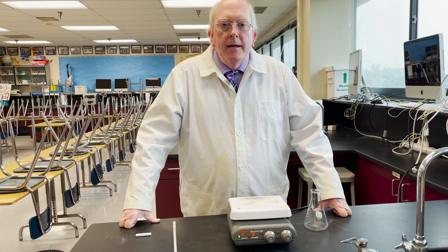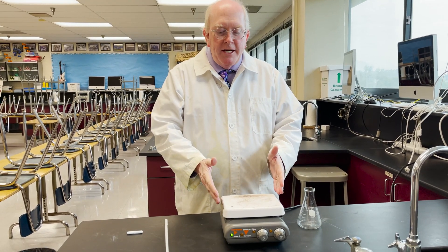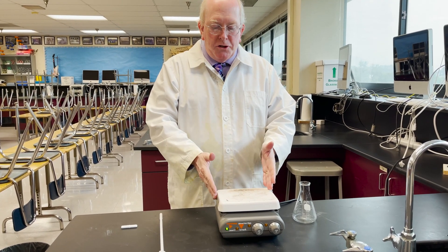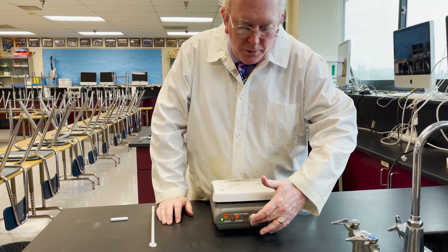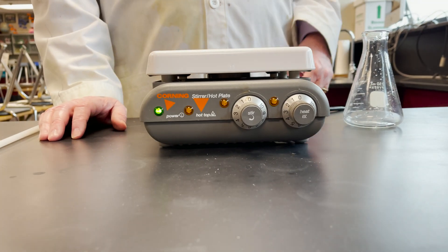Hey everyone, Morgan here. We're going to be talking about a really spiffy piece of lab equipment today, which is a combination hot plate stir plate. Now you will notice there are two controls on them — one that says heat and one that says stir.